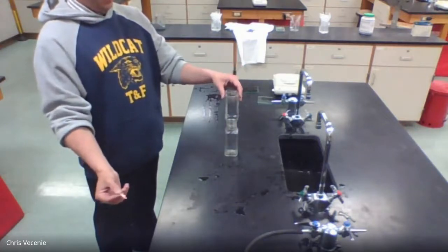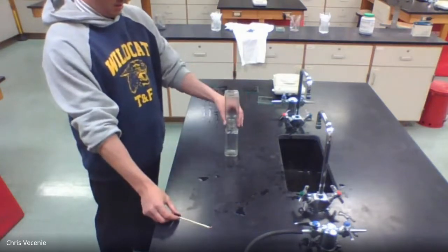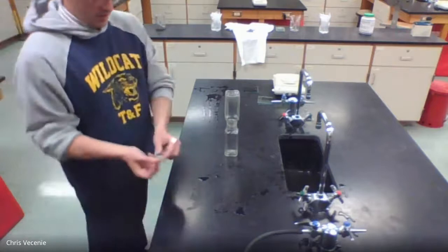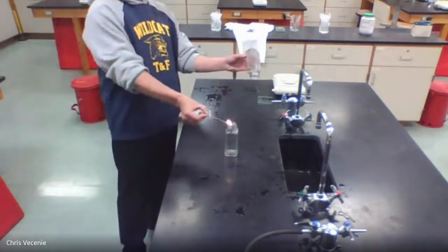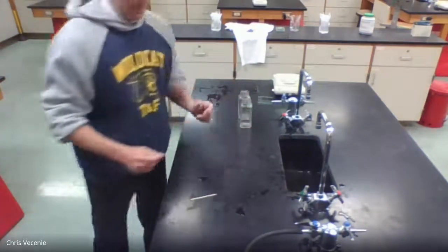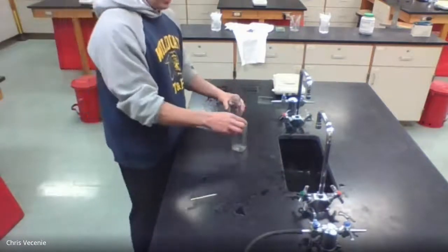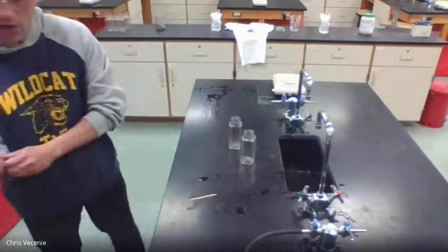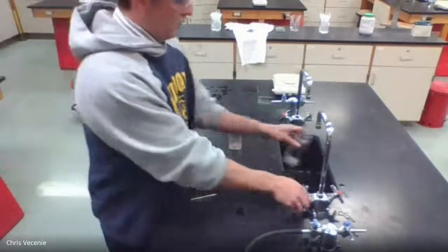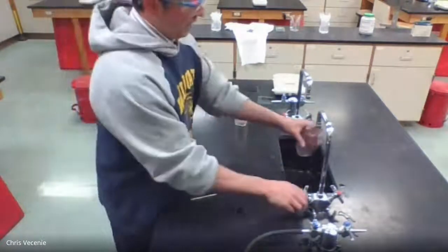So here's bottle one. Okay, it doesn't seem like anything happened there. Try this one into bottle two. Okay. All right, so looks like for some reason, which happens, our hydrogen somehow escaped. Maybe we didn't have a perfect seal on the top. But my observations for that are going to be flame stayed lit, which for you guys is going to indicate missing hydrogen. So we can't confirm or deny the diffusion.